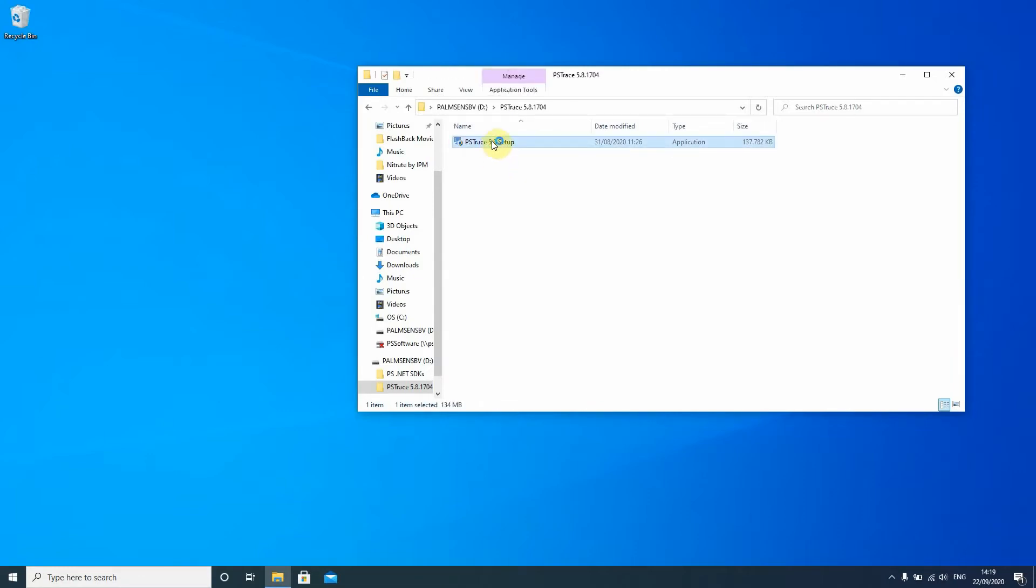Then you open the folder if it doesn't open by itself and there you find the setup file. You just double-click it and then you wait for Windows to ask for permission to make changes and of course you agree.